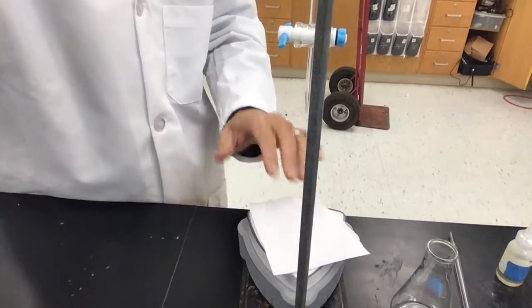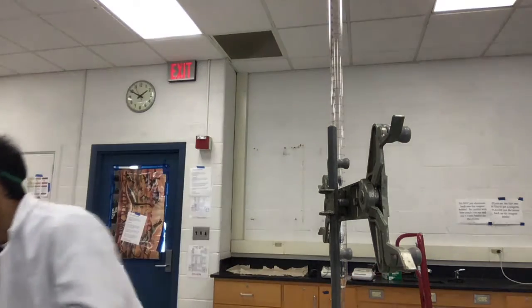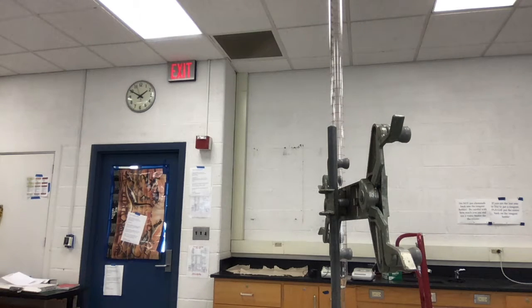Okay, and this down here is a stir plate, and I'll show you what a stir plate is. It's possibly the most exciting thing that students get to use. Well, I think the Buret is actually very exciting too, but students love stir plates for some reason. And here, I'll show you.